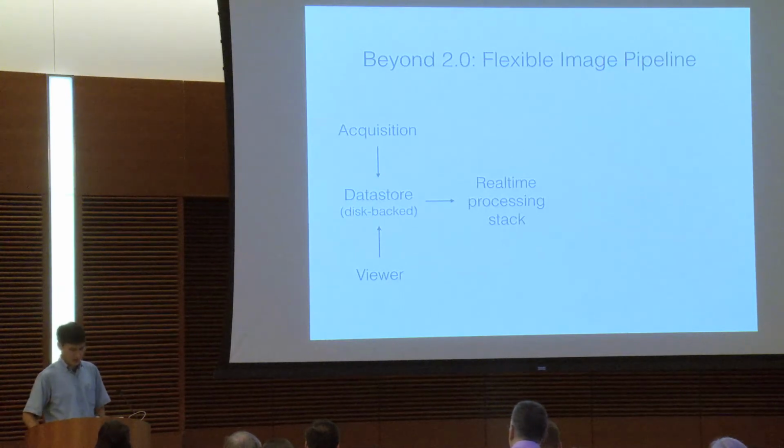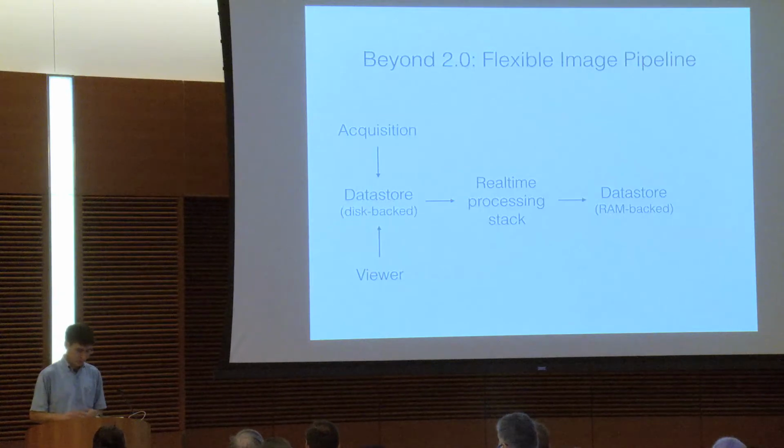And one of those is processing images as they are acquired, even in live view. And so we want to provide an image processing pipeline. And this is not as much a reinvention of various workflow systems like µIME as much as a very specific targeted thing that's optimized for real-time processing as you acquire images.